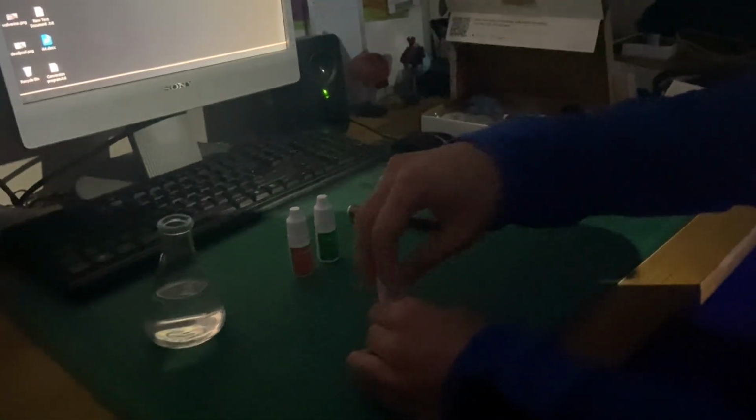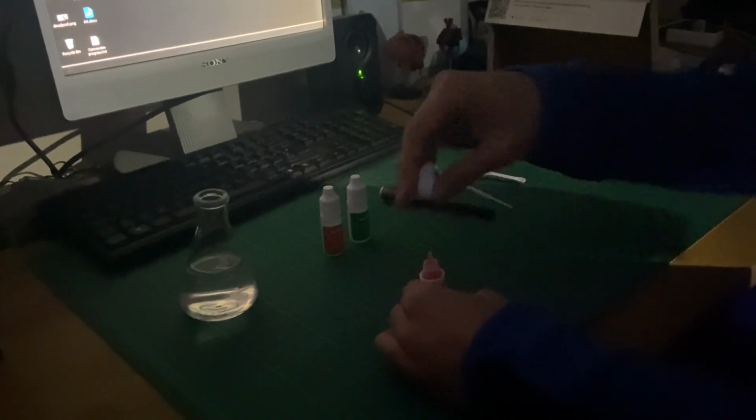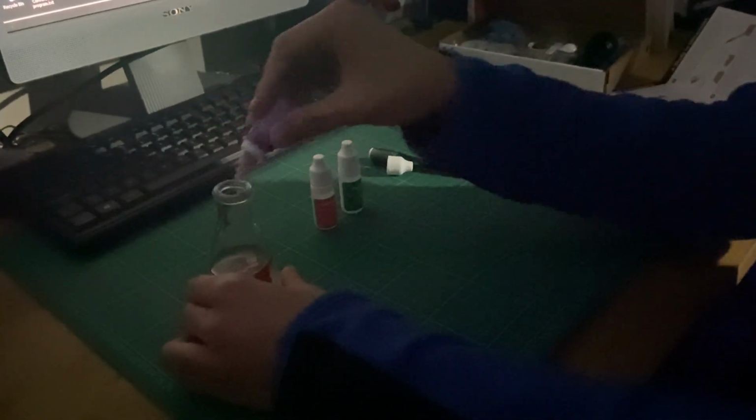Firstly, we'll add 3 drops of eosin into water and mix, resulting in a brown solution. Eosin is a strong dye, often used as a stain in histology, its negativity allowing it to bind to positive components in the cell, such as positive proteins in the cytoplasm and muscle fibers, staining them in shades of color from pink to red.